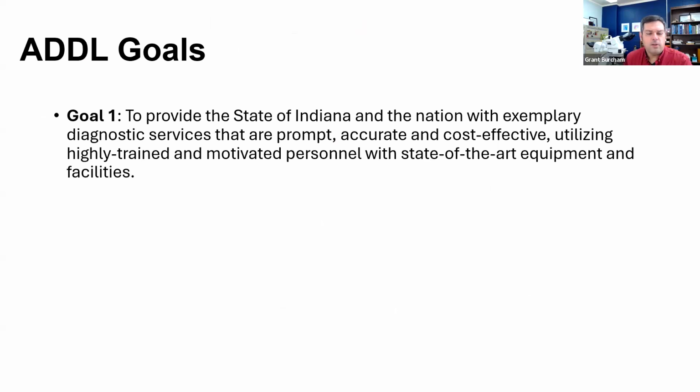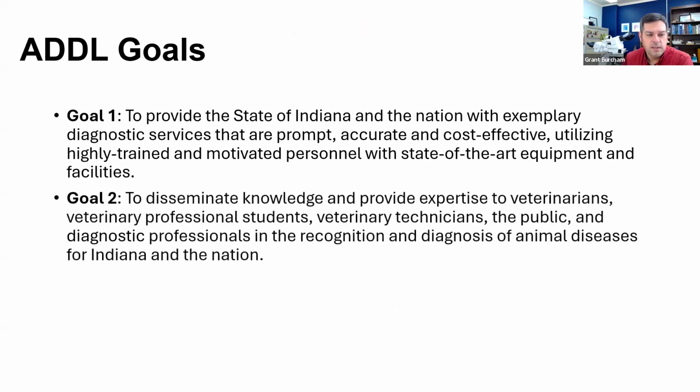So what is it exactly that we do? These were specific goals that the ADDL has that I think are helpful with explaining to the general population what it is we actually do. So providing diagnostic testing services that are prompt and accurate, using what we consider state-of-the-art equipment and facilities.